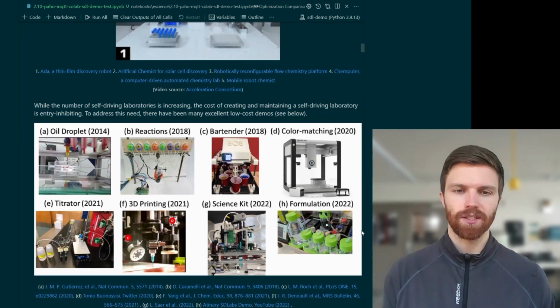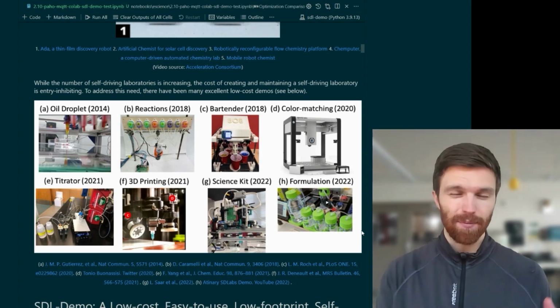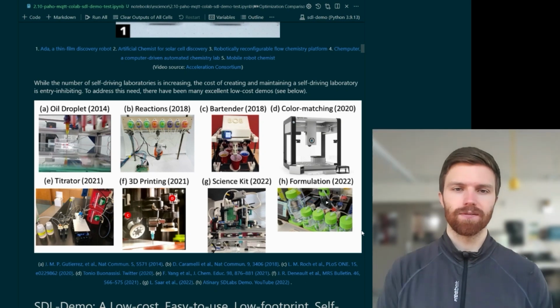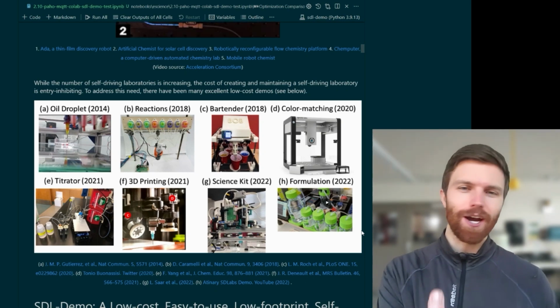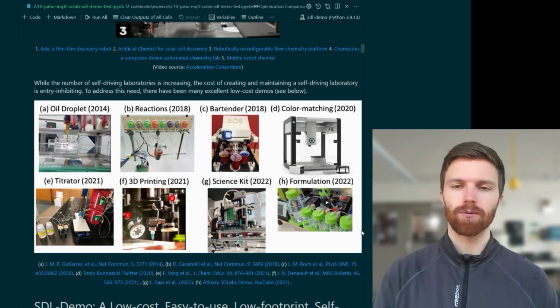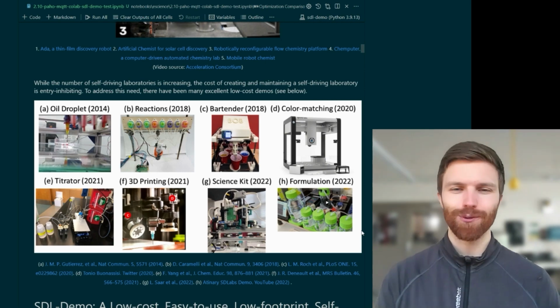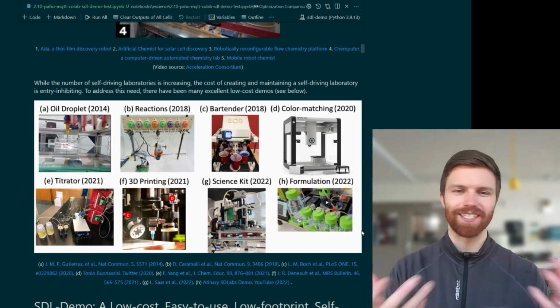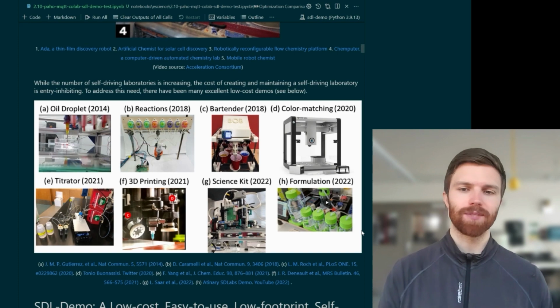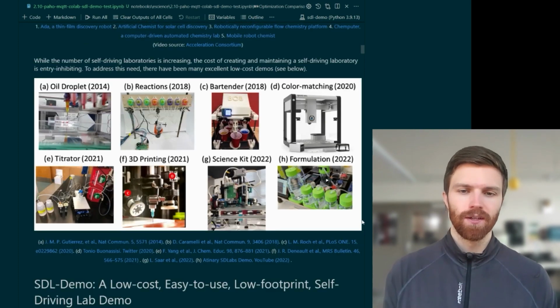What the community has done is developed a series of different prototyping and teaching platforms. You've got this Bayesian optimization bartender, or Bob, and different experiments done by the Cronin laboratory. You have some open source solutions like OpenTrons, and Lego Mindstorm kits or equivalents being adapted, 3D printers being adapted, and all sorts of really great teaching examples.